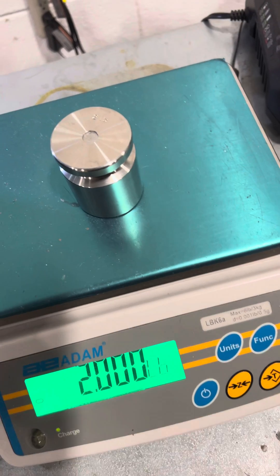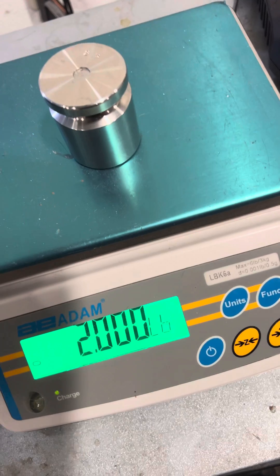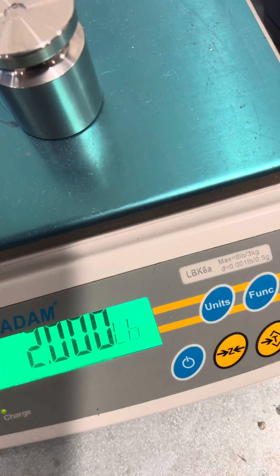It says pass, and it automatically bounces out to weigh mode. That is how you adjust the calibration of the Atom LBK series.